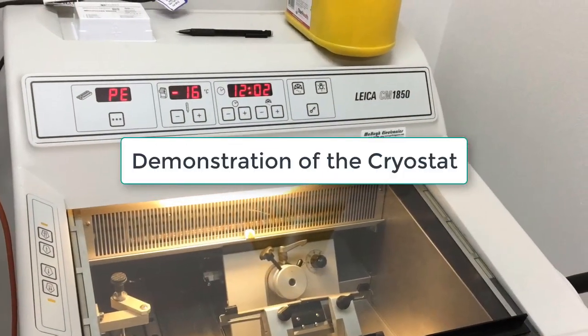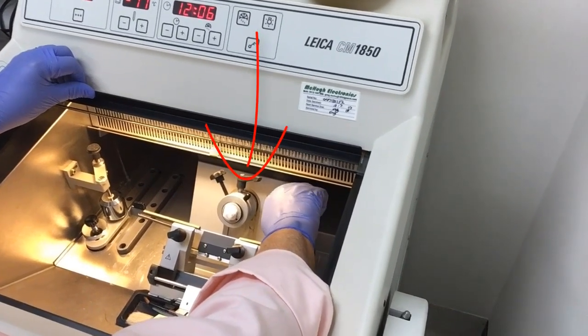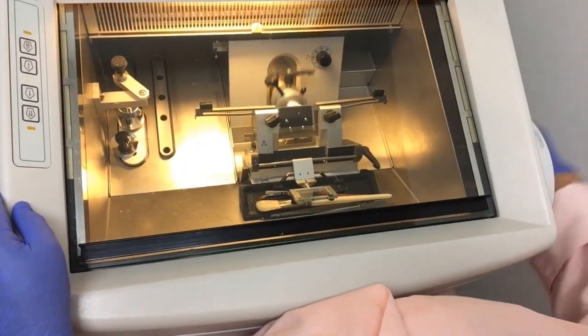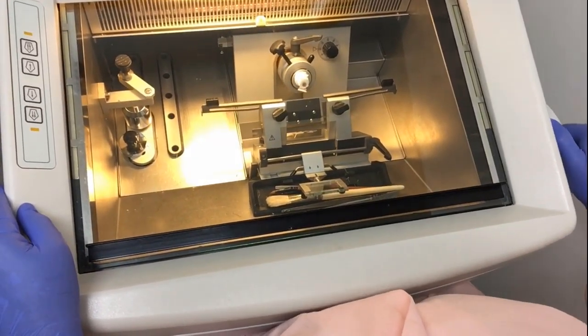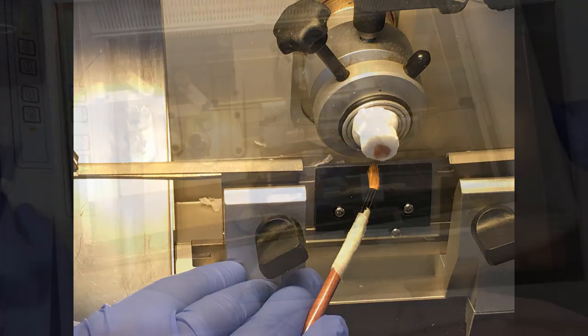Let's have a look at a demonstration of the cryostat first. The fresh tissue sample is rapidly frozen and mounted onto the chuck using a liquid medium that sets solid and holds the tissue in place. The tissue can then be trimmed so the full face of the block is exposed. Remember the blade is sharp — use safety precautions when handling fresh tissue and cutting on the cryostat.